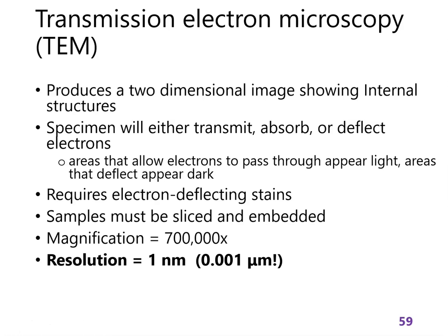So you have to get an antibody and attach a gold particle to it or something like that. You can get really high magnification, really great resolution, and this is how you can study the structures inside a cell. Again, you can use an antibody to attach to something inside a cell, and use transmission electron microscopy to see a cross-section of the cell.